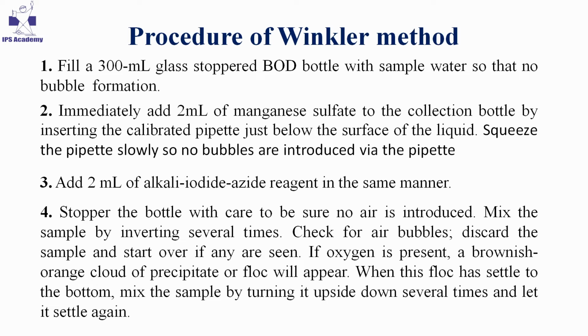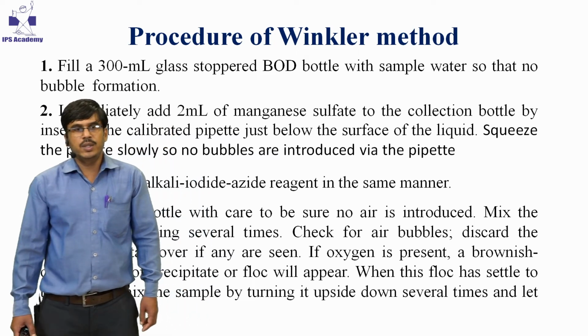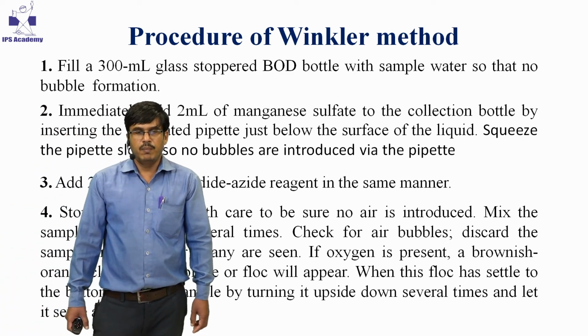If oxygen is present, a brownish orange precipitate will be generated in the bottle.